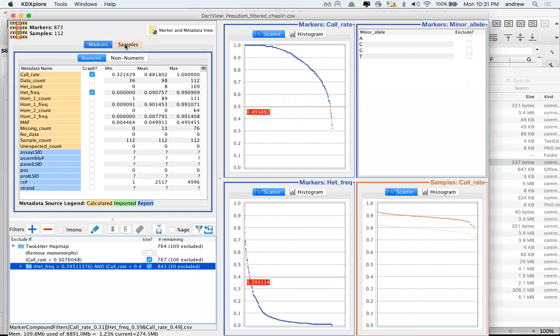This is Palival. My question is how big a file can be handled? How much data can be handled? Is there any restriction, or does it only depend on the memory? It's a good question. To be honest, this version doesn't perform very well for larger data sets, and a large part of the last several weeks, I've been working to optimize on that front. We want to aim for data sets up to 1 gigabyte in size. So that's our roadmap at the moment.